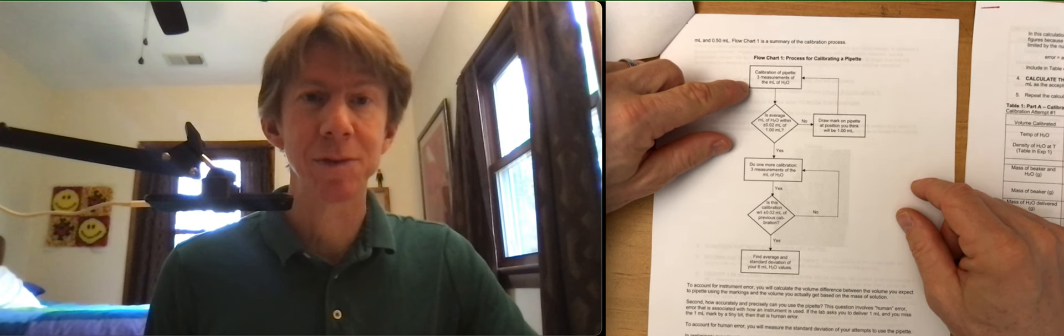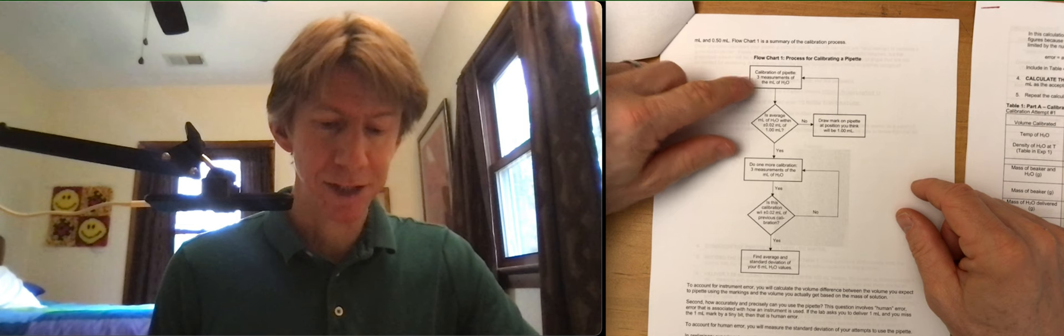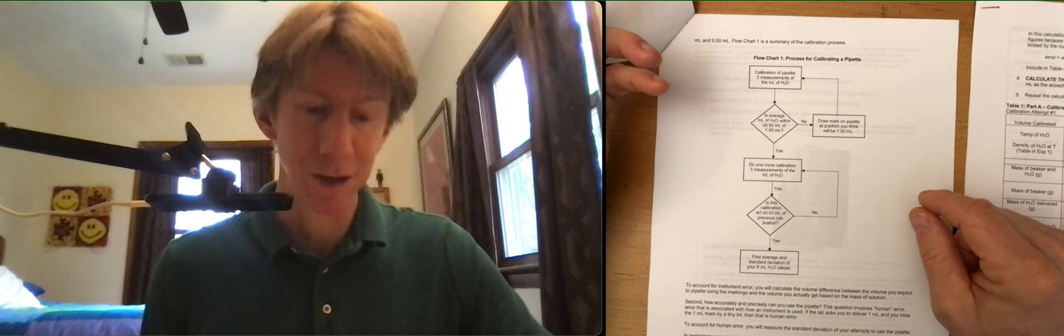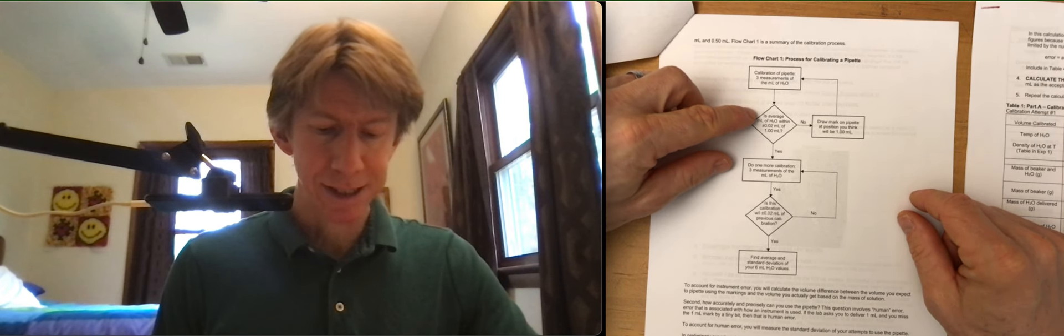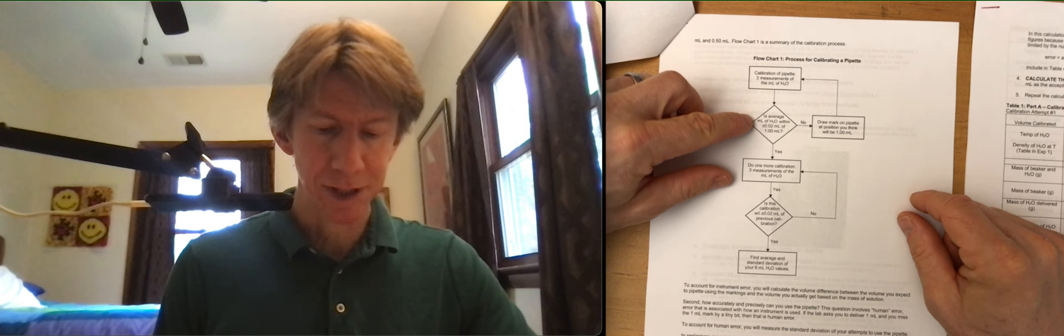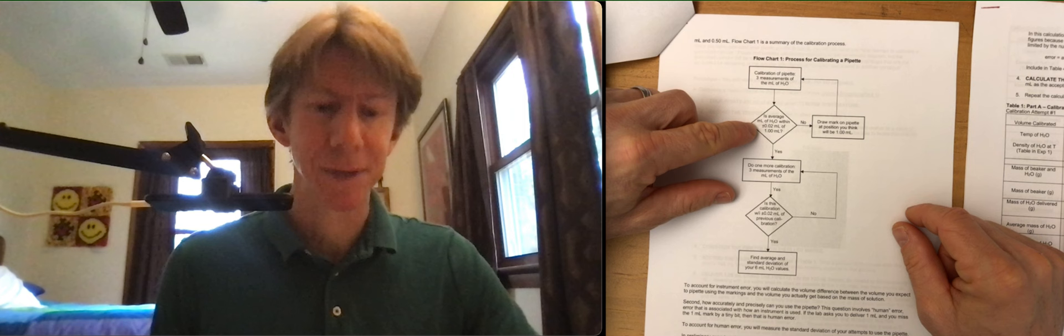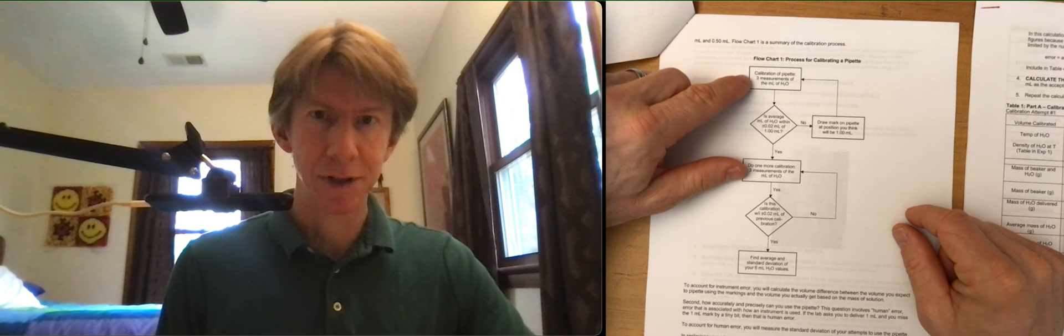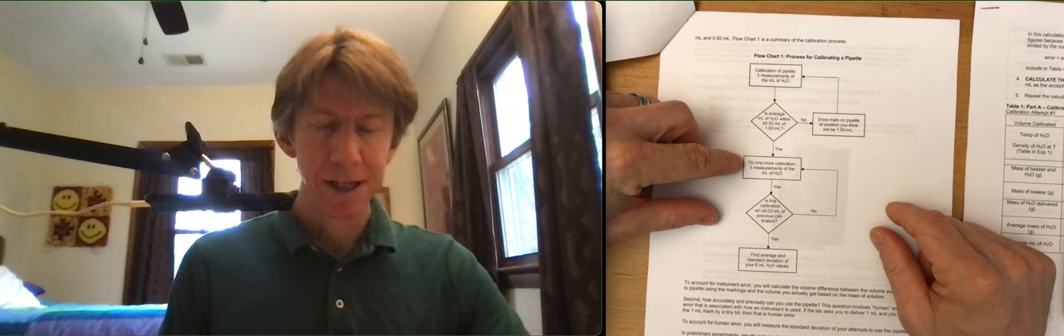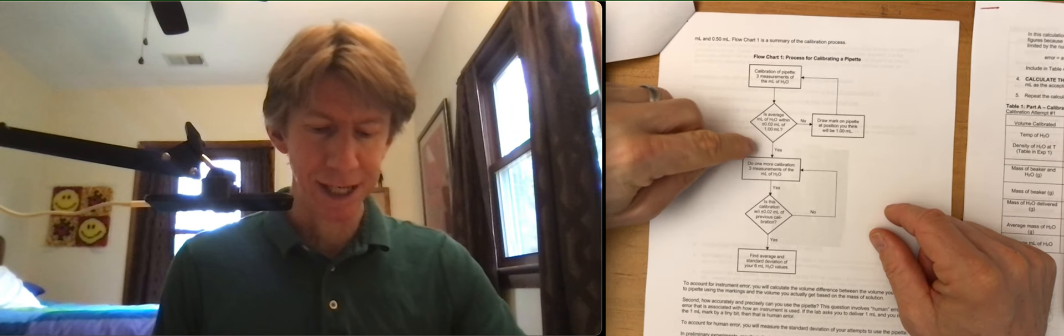You're going to do three measurements of the milliliters of H2O for one milliliter let's say. And then is the average milliliters of H2O within plus or minus 0.02 milliliters of one milliliter? That's the average of the three measurements. Yes. Those three measurements are good.